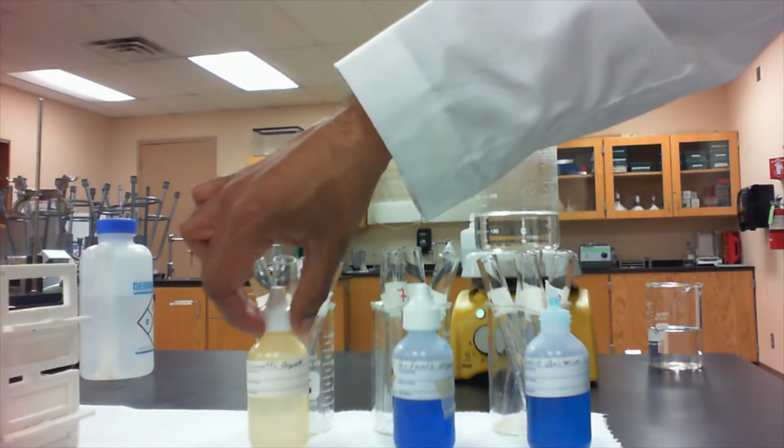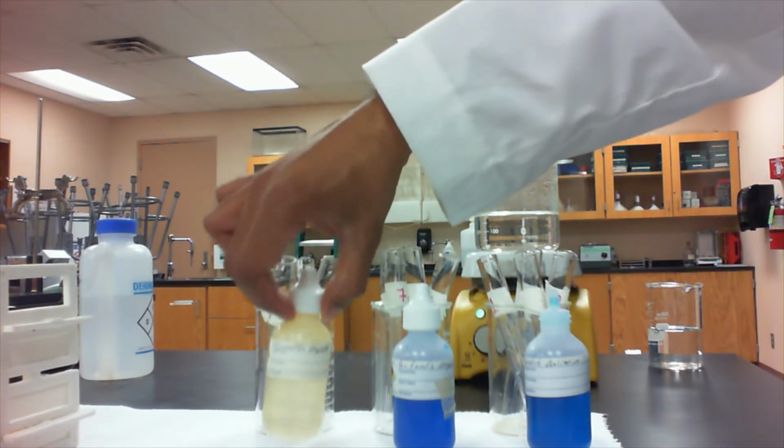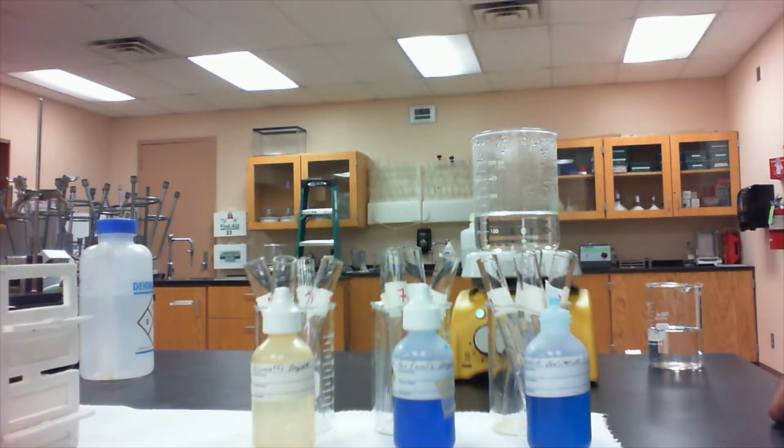Monosaccharides have just 1 sugar unit, whereas di- and tri- and polysaccharides have multiple sugar units linked together. And the 3rd test uses the Seliwanoff's reagent, which is able to distinguish between a ketose, which is a sugar that has a ketone group in it, versus an aldose, which is a sugar that has an aldehyde group in it.